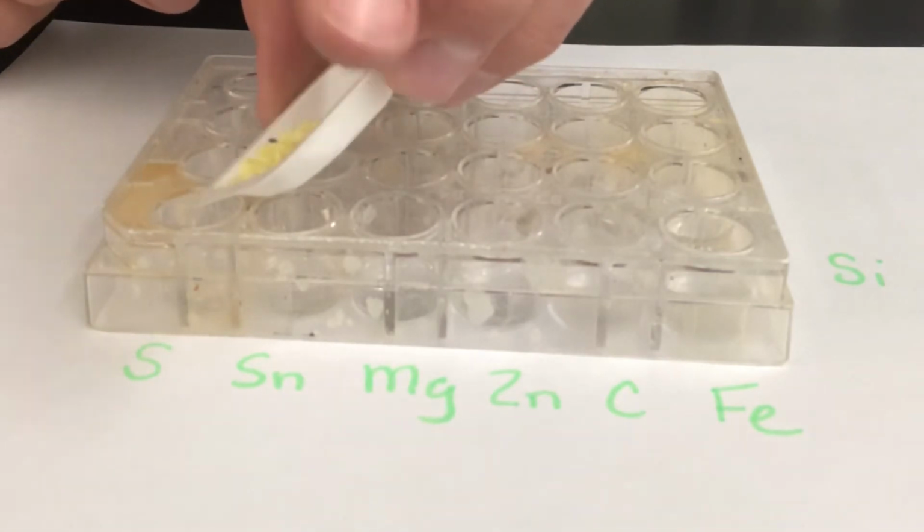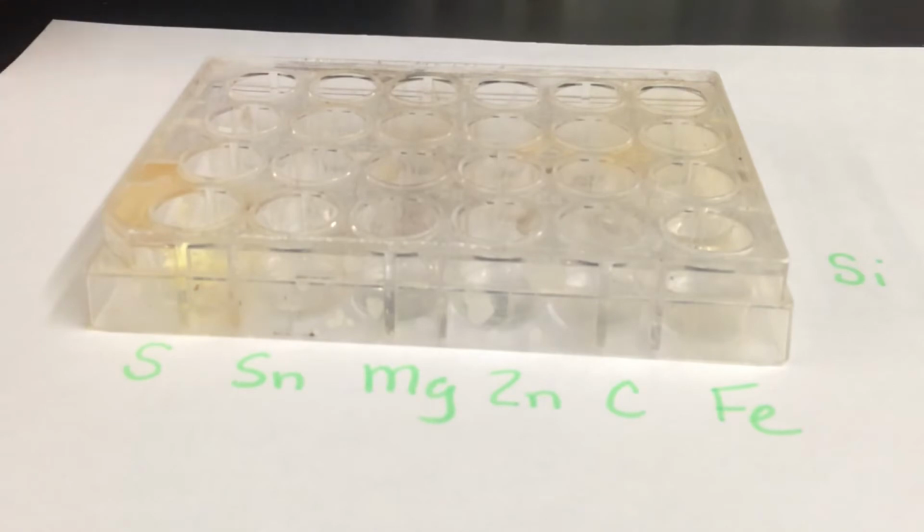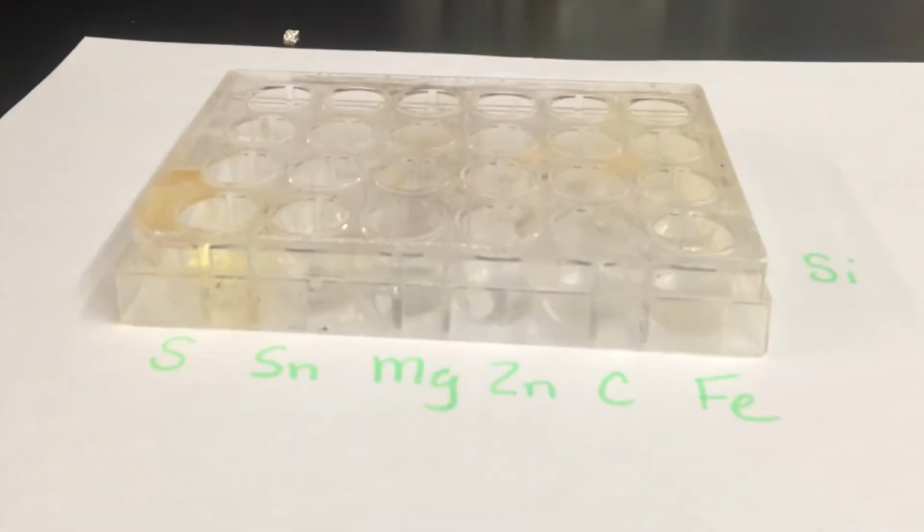So in my first spot plate, I'm going to put some pure sulfur. In my second one, I have it labeled, I'm going to put some tin. In my third spot, I'm going to put some magnesium. Wow, and right away, magnesium, you start to see it fizz and bubble. Wow, so that's definitely reacting.